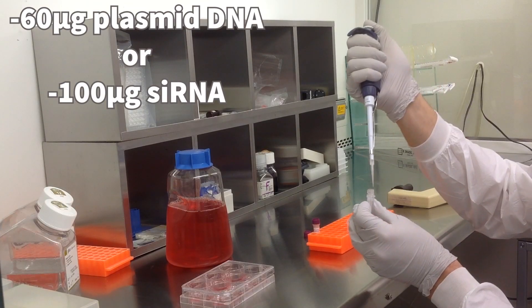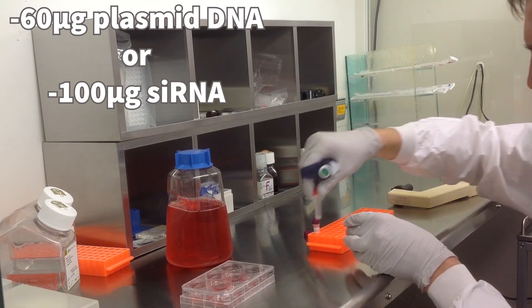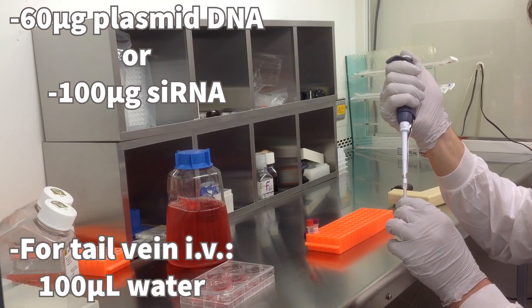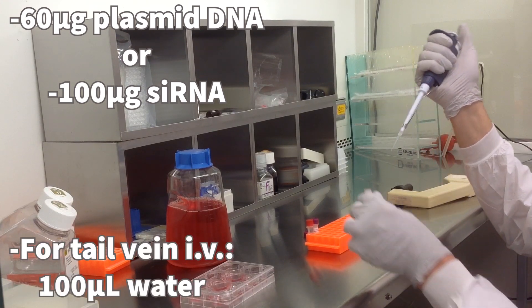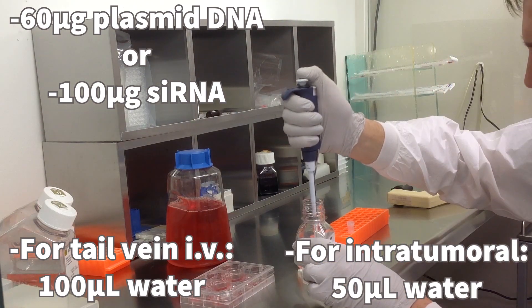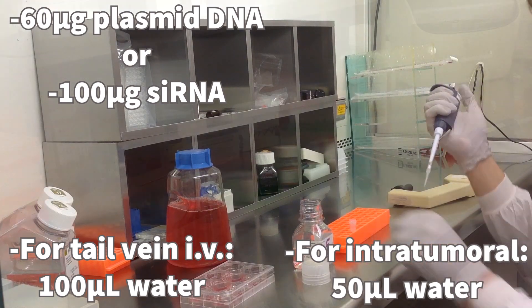Start by diluting 60 micrograms of plasmid DNA or 100 micrograms of sRNA into either 100 microliters of water for tail vein IV, or 50 microliters of water for intratumoral IT administration. All water used is DNA/RNA-free molecular biology grade water.